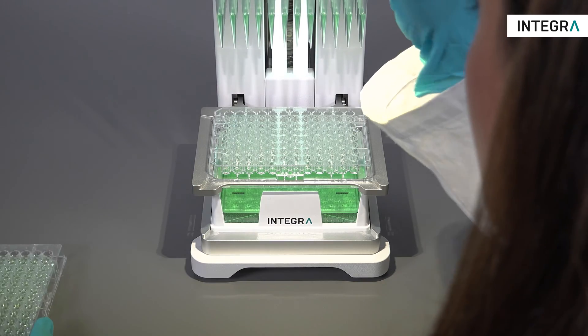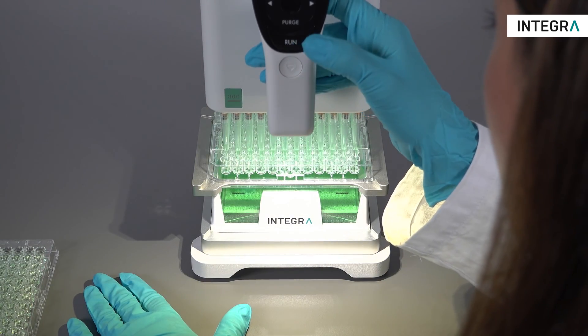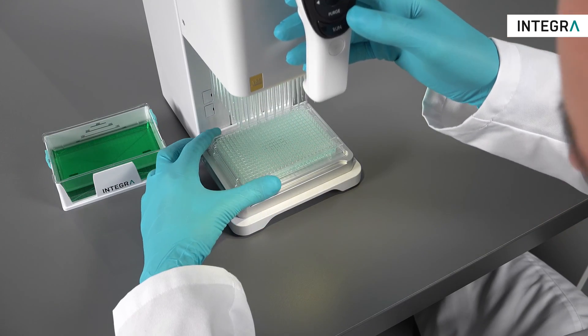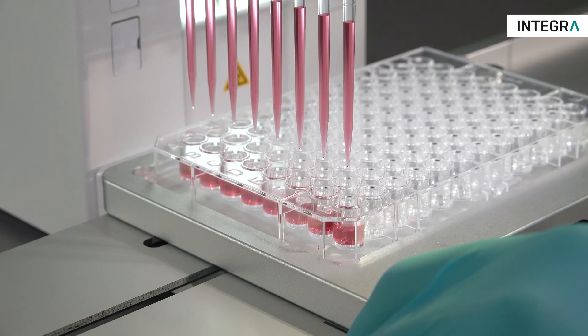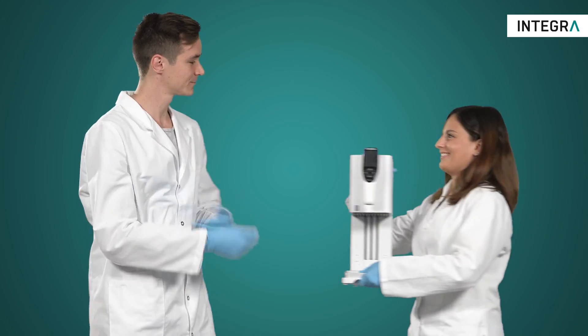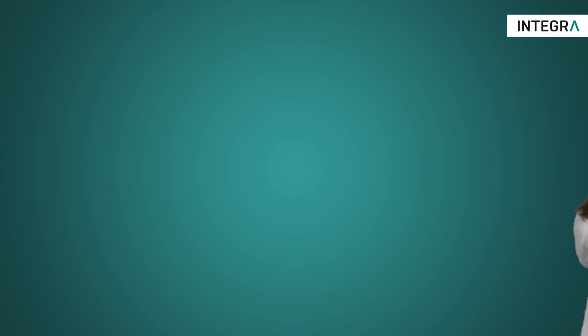This instrument is simply the most affordable electronic 96 channel pipette available. Considering that 96 and 384 well plates can be filled in one go, as well as partial plates, the small price compared to the benefit it brings is unbelievable. The MINI 96 is well within reach of every lab's budget.